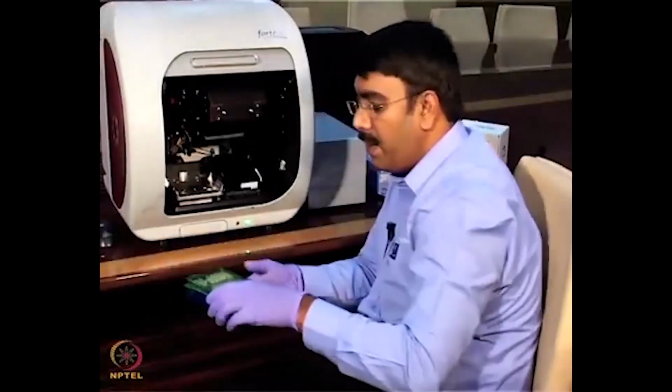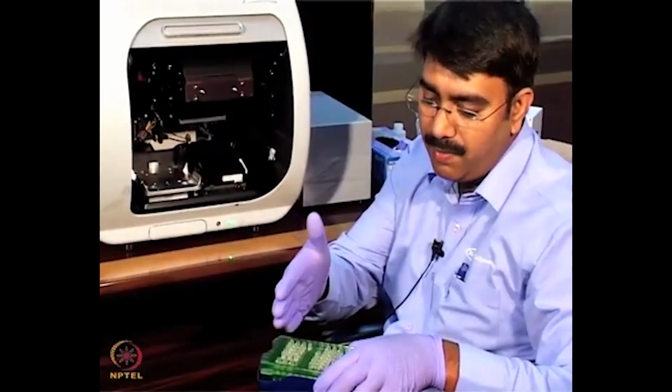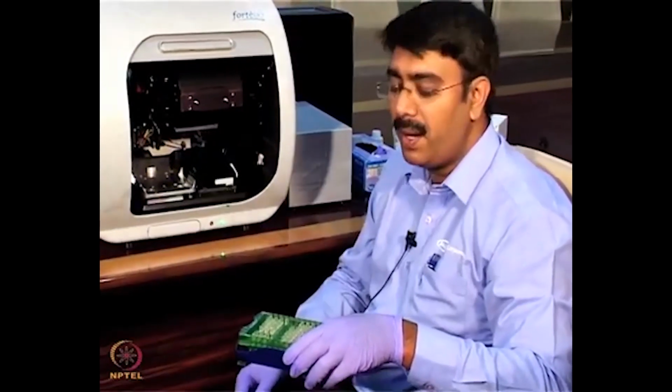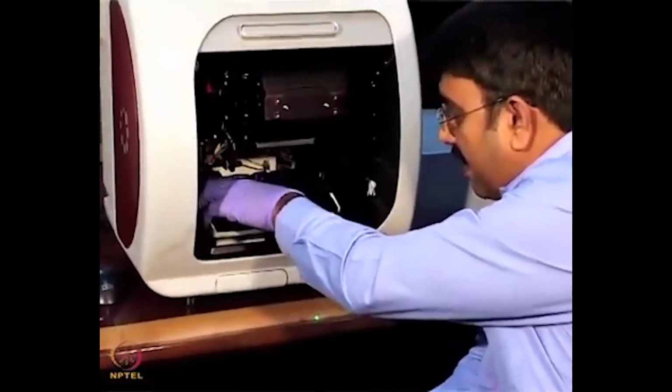So here I am going to place the sensor compartment. We can pick up the sensors from column 1, column 2 or column 3, anywhere. We can program it in the instrument accordingly. We are placing the sensor rack like this.